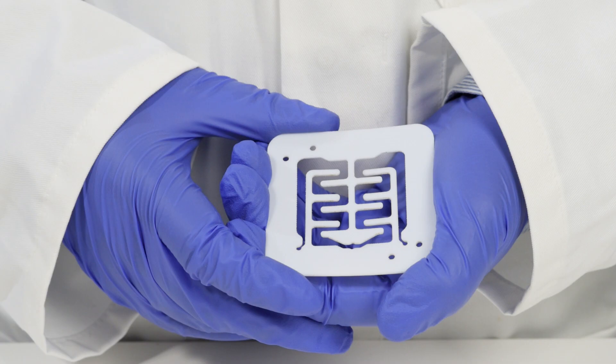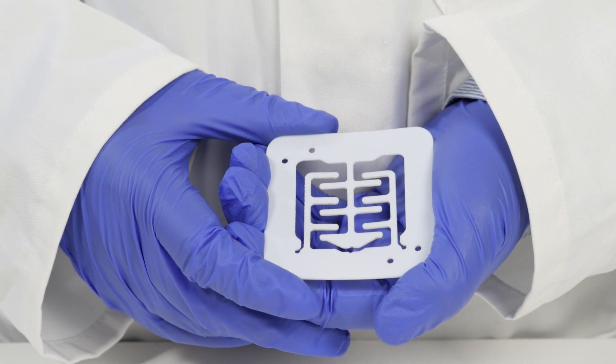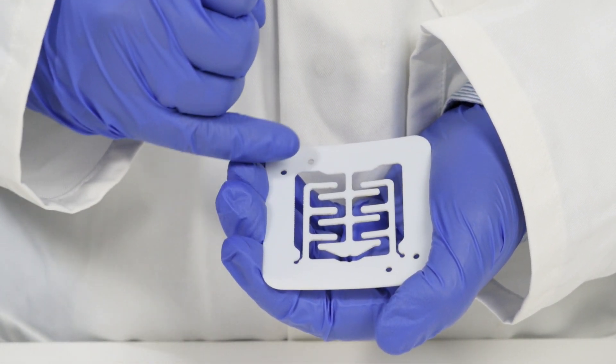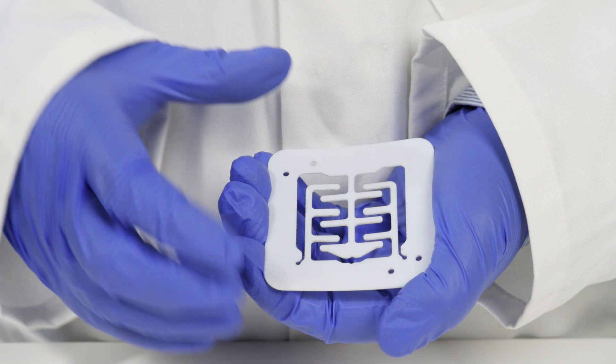Next is the membrane. The membrane in the electrochemical reactor determines the flow path that your reagent solution takes over the electrode.